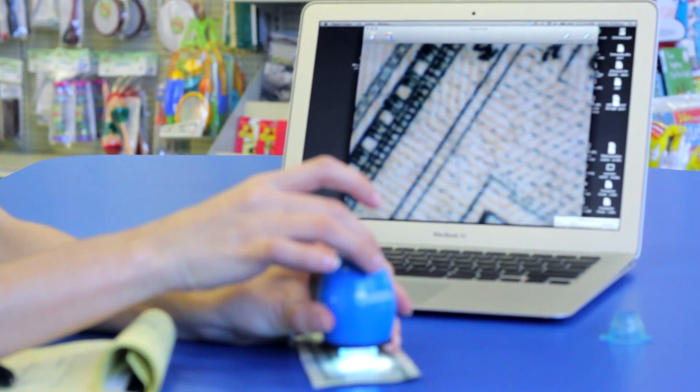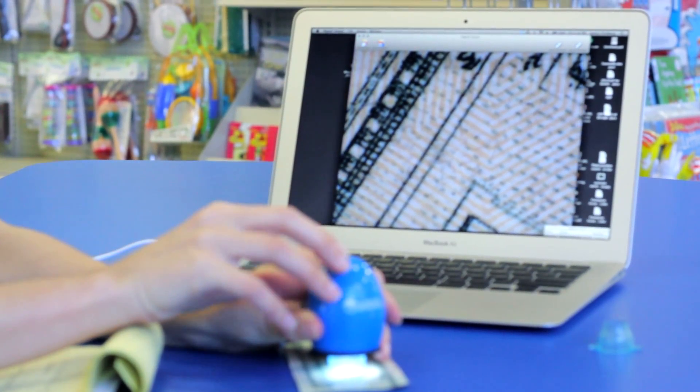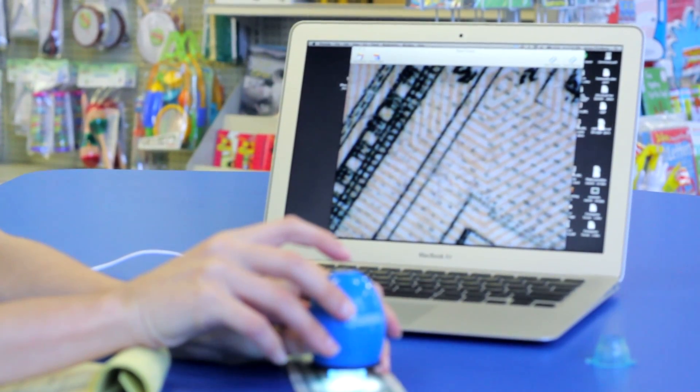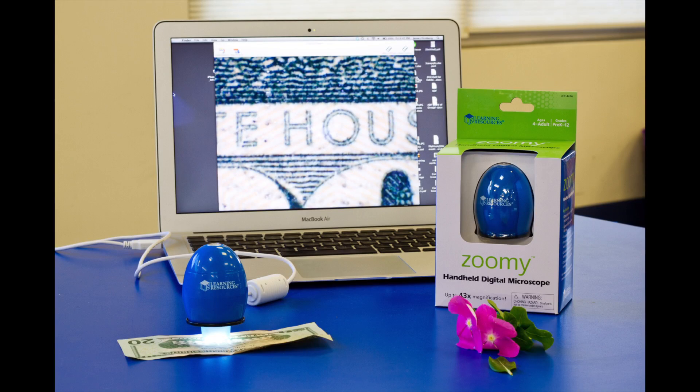It takes 640 by 480 resolution photos. It also takes video. It's simple to use and easy to install.